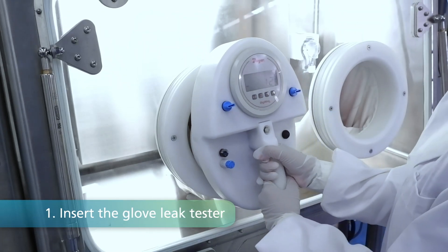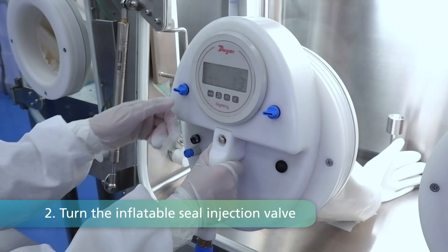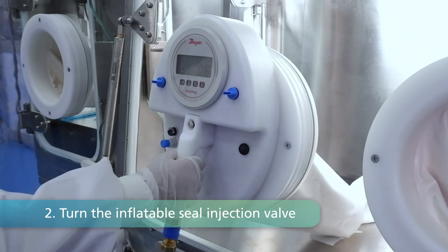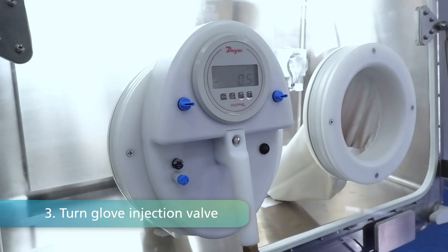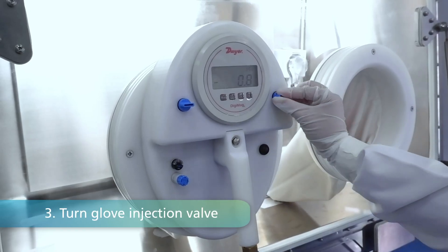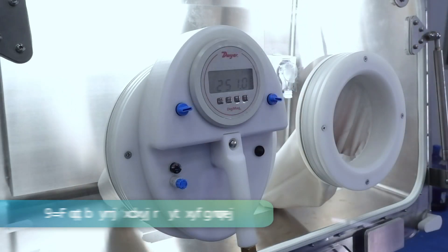Step 1: Simply insert the Glove Leak Tester into the glove, ensuring a snug fit. Step 2: Turn the inflatable seal injection valve to securely dock the tester in place. Step 3: Initiate the pressure injection by turning the Glove Injection Valve, ensuring it surpasses 250 Pa.